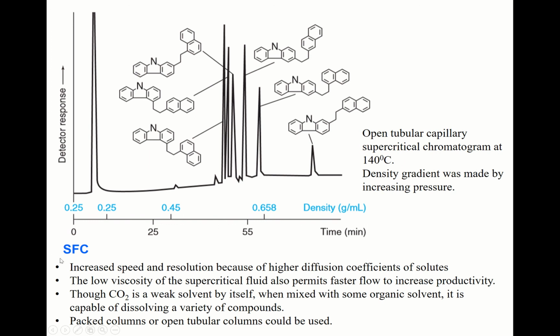So this is supercritical fluid chromatography. Increasing density makes separation faster, increasing speed and resolution. The peaks are closely spaced, but separation is good.